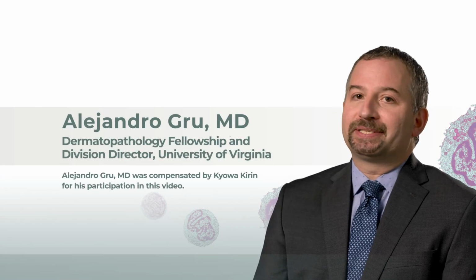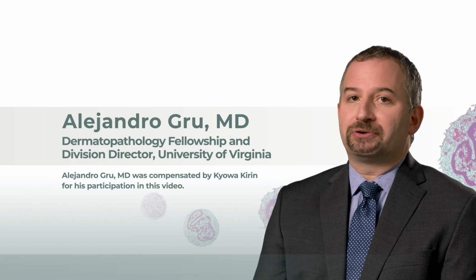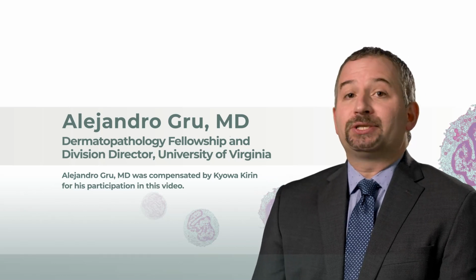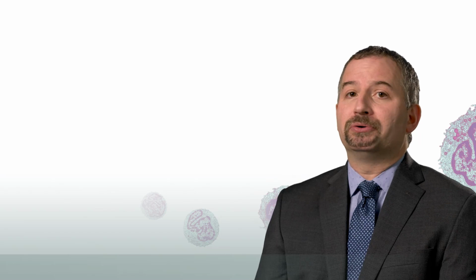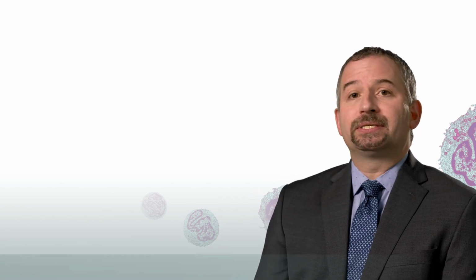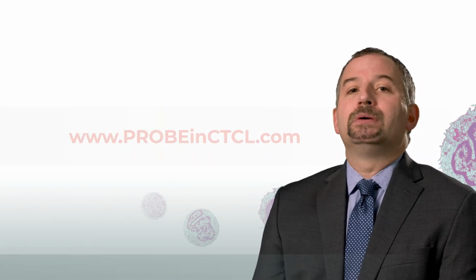Cutaneous T-cell lymphoma subtypes Mycosis fungoides, or MF, and Sézary syndrome are multi-compartmental diseases. That's why the National Comprehensive Cancer Network guidelines recommend a multimodal diagnostic approach for optimal patient management. As we'll discuss, this includes using flow cytometry for evaluating blood involvement when appropriate.